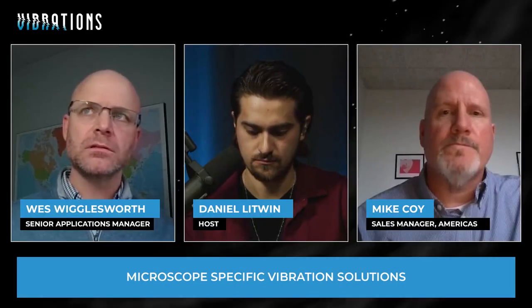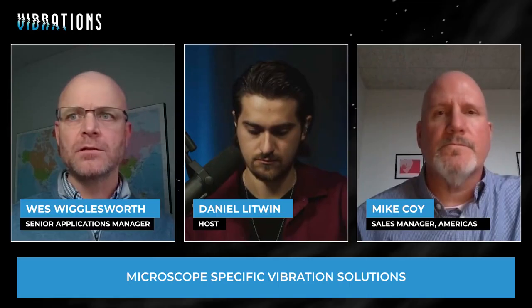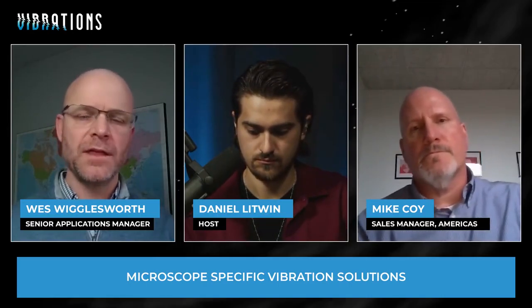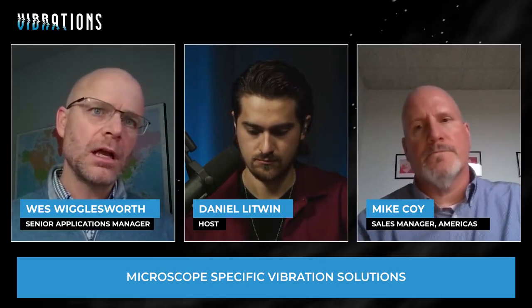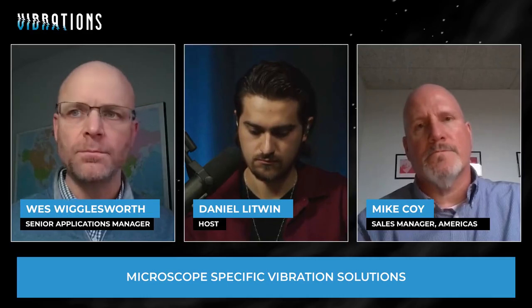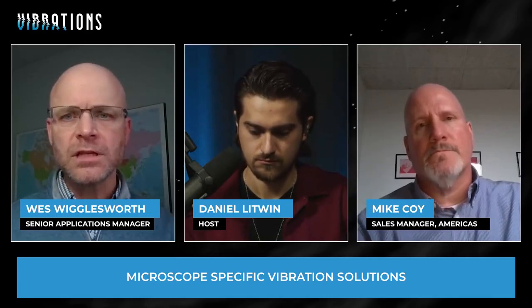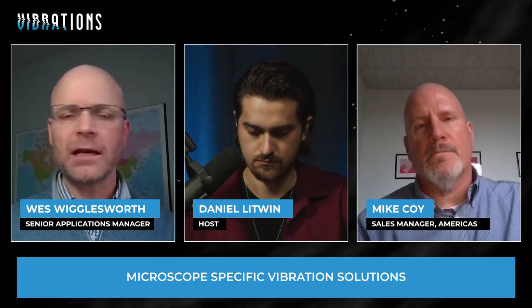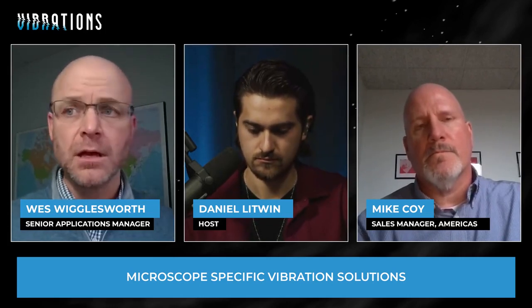Along those same lines, you have microscopes that are much more advanced and more sophisticated than others. So you mentioned optical microscope. So optical microscope or a light microscope, these are typically tabletop instruments that can magnify, say, 40x, but they can also magnify up to, say, 2000x.